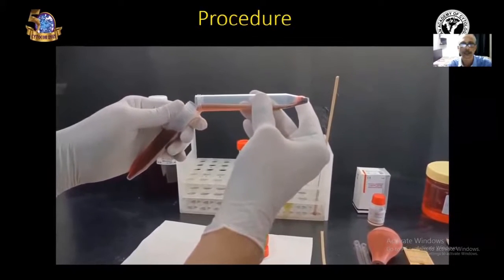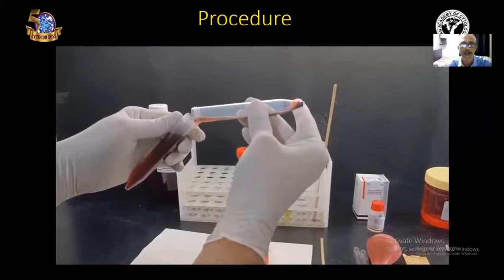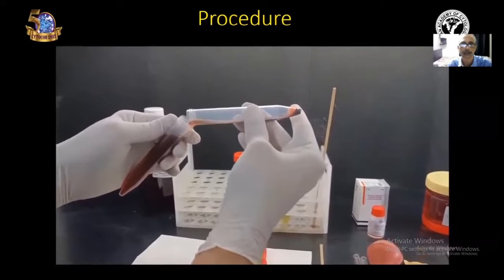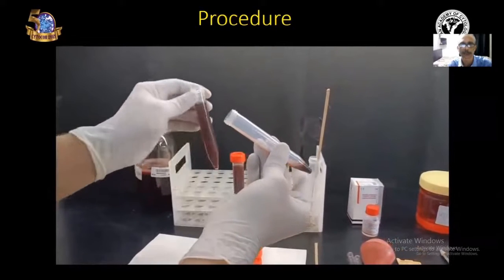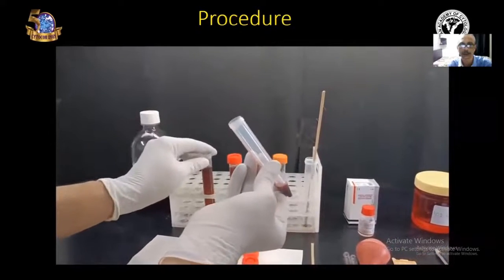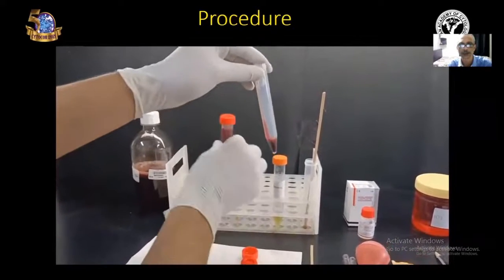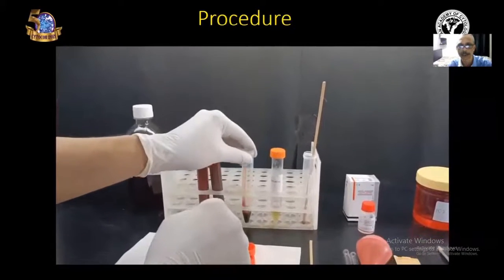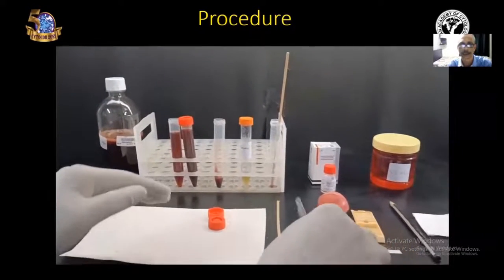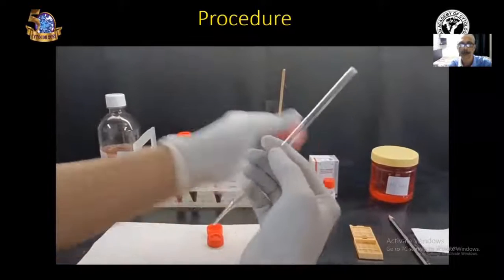Now, the supernatant is almost completely separated and the tube is kept aside. This is the tube with the sediment. Keep it aside, and the next step is adding the plasma.